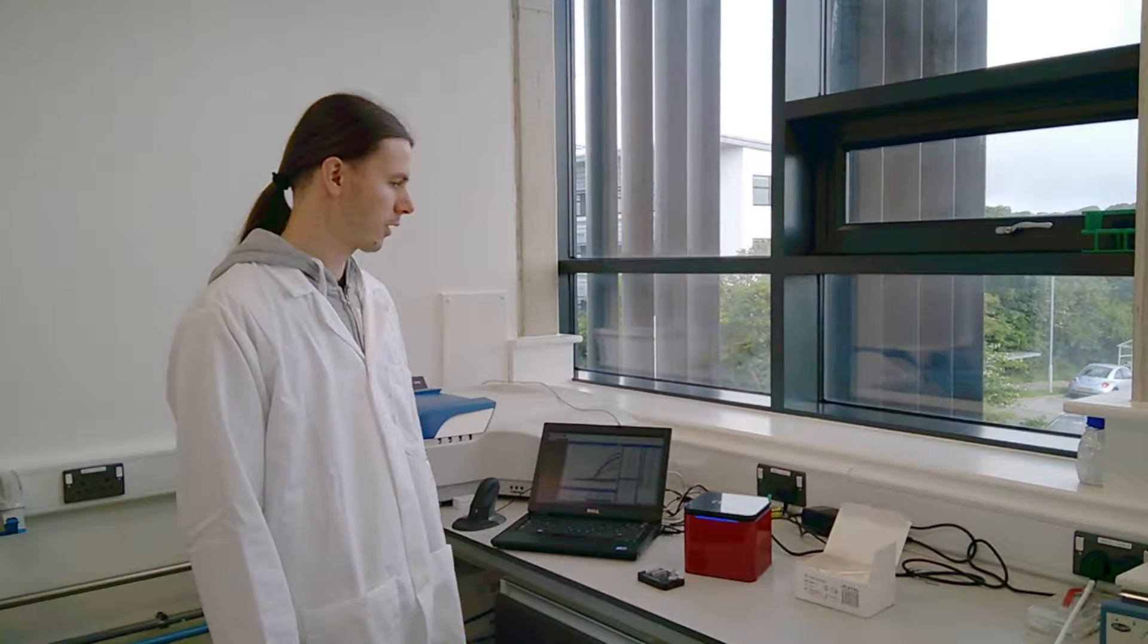Hello, my name is Christoph Zimmer. I'm a research fellow at the University of Exeter, and I just want to quickly share my experience with the MIG, the Magnetic Induction Cycler.